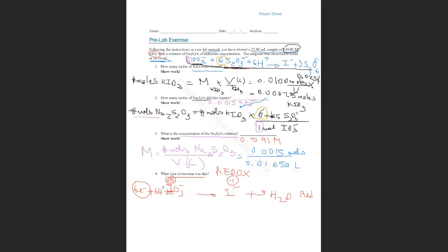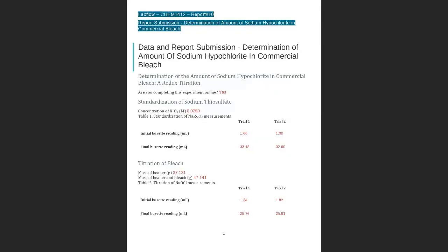So now that we saw some practice and we looked at the general information, we went over the write-up, let's go over the report and see how we are going to do the calculations. So you will see a report like this.